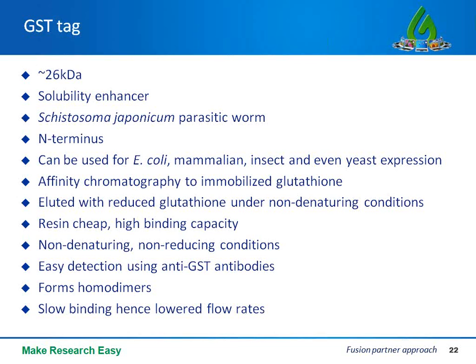And also the kinetics of GST binding to glutathione resin and its elution are really slow. So GST fusion proteins need to be loaded, washed and eluted at really slow flow rates. You can't do it quickly like with the his tag.